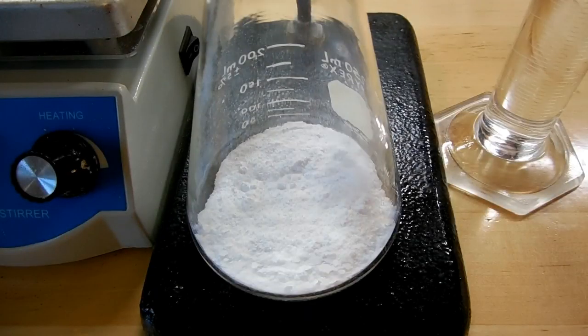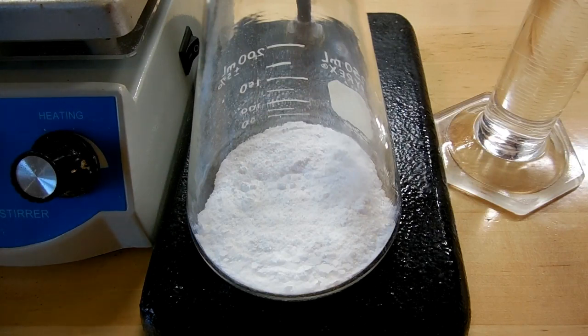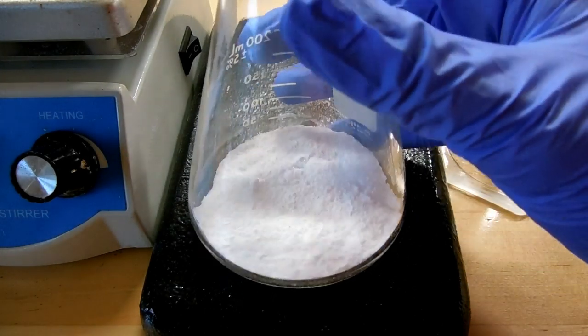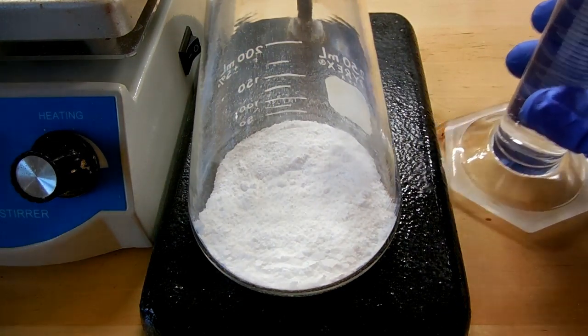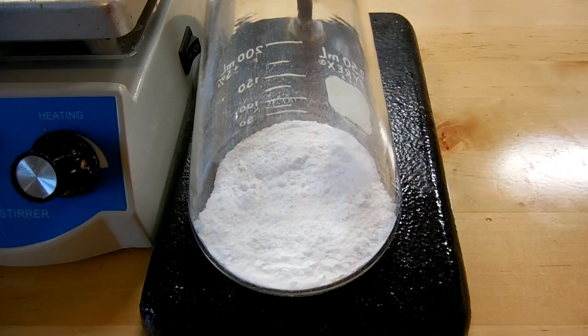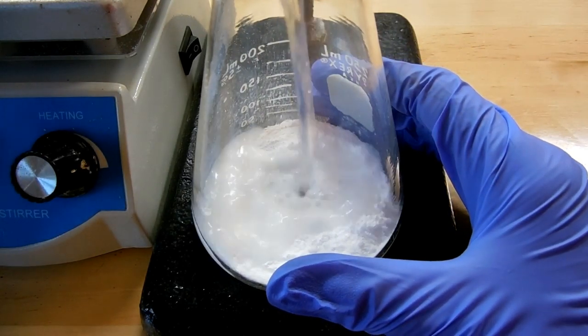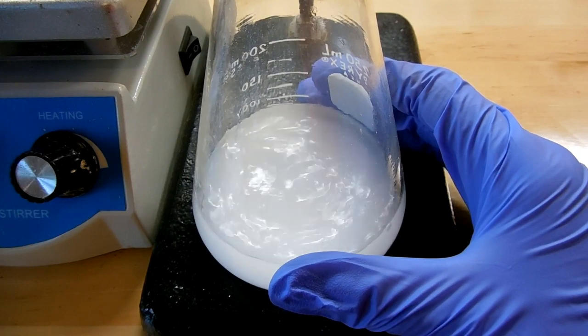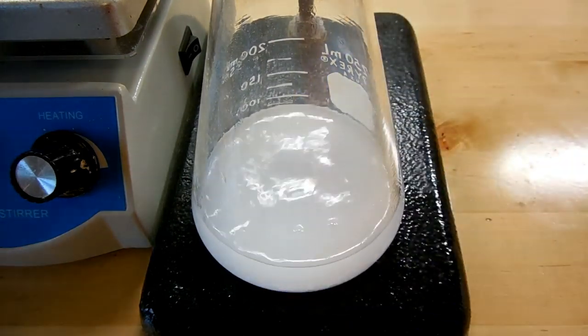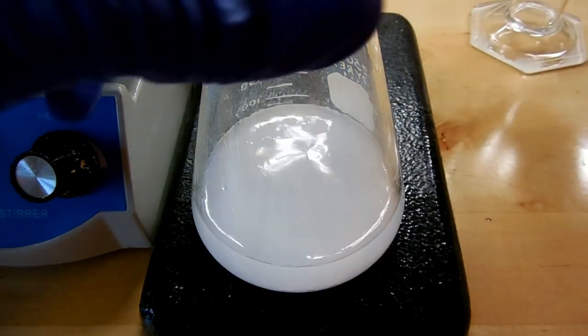I've ground the tablets down into a fine powder and gotten some other equipment out. Now we're going to add the methanol to the ground up aspirin tablets. I've got 60 milliliters of methanol in the graduated cylinder here that I'm going to add, and we want to swirl this around to try to dissolve as much as possible.